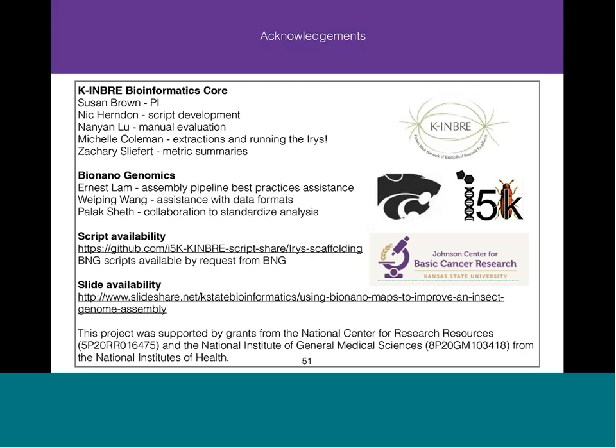Okay. Yes, I believe you're correct. I think I've seen that. I can't describe the project, but I've worked on a project where I've seen a repeat that I think was a telomere. We just manually say, look at that position, look at that pattern. I think that might be a telomere. That's not something that we have automated software to identify currently. We have some idea of where some of the telomeres are and some of the sequence for telomeres in Tribolium. We have not looked specifically to see whether the BNG maps get us farther into the telomeres.